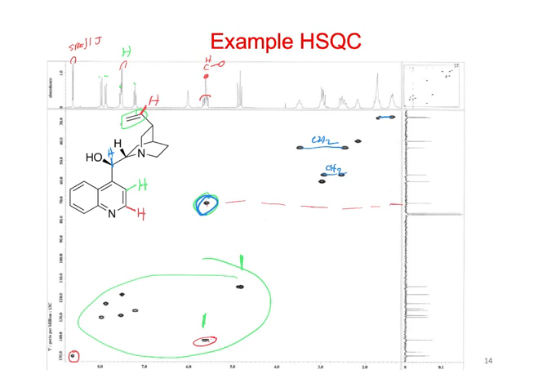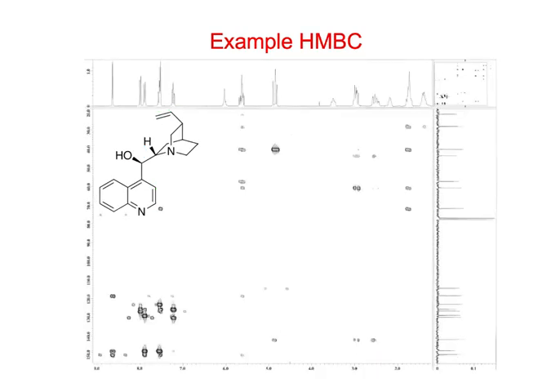Right? You see that? Because we have this peak here. Okay, so this one is the one that I have in red on the double bond, and this one is the one in blue next to the oxygen, and they are just overlapping in the proton spectrum. So then we can do, oh no, it isn't. I think it was, but I didn't have the data here.